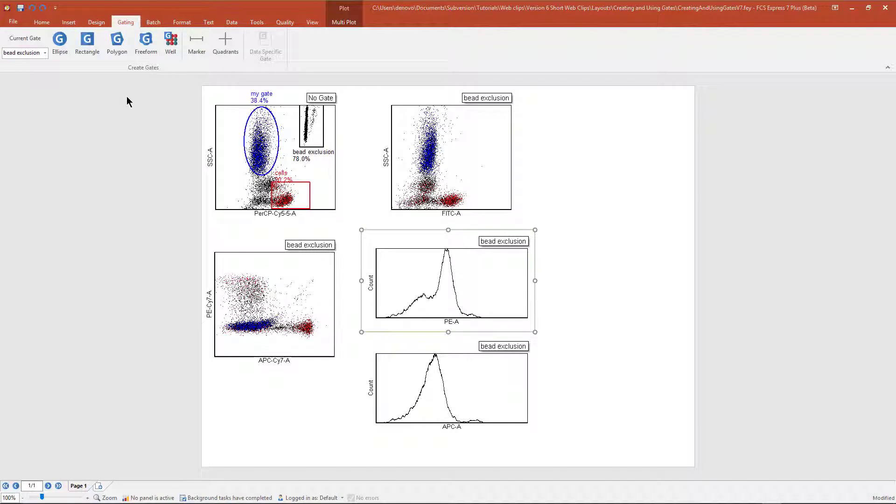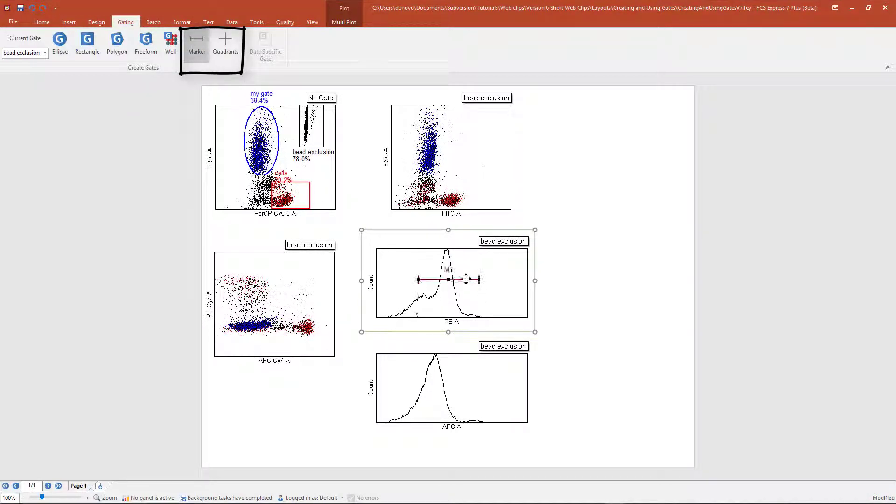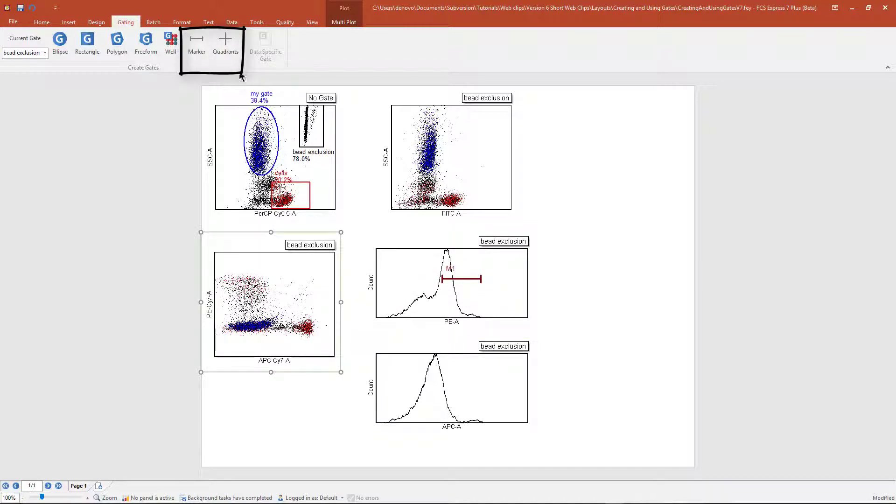From the Gating tab in FCS Express, you can also create markers, which can be moved around or resized, and quadrants.